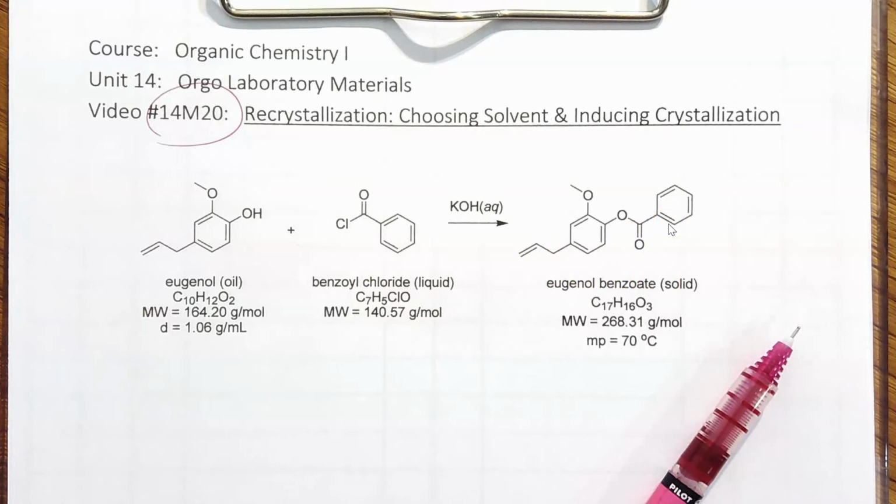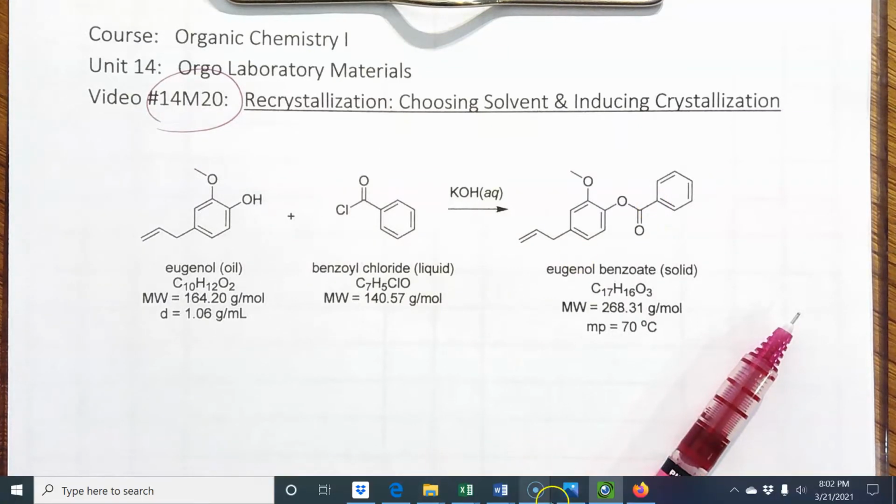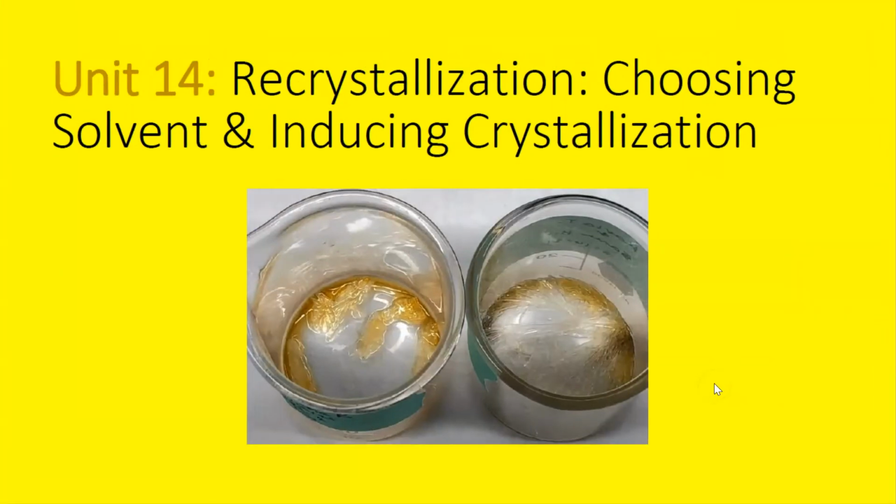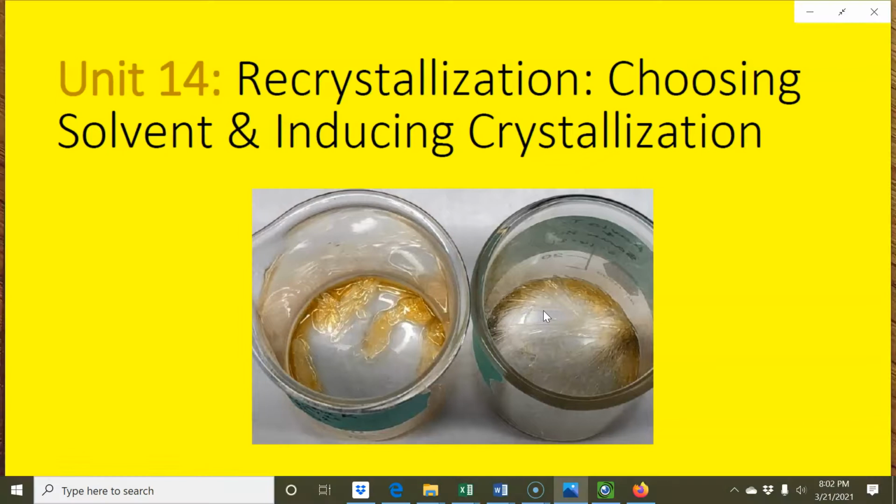But after a quick water wash and evaporation of the dichloromethane organic layer, the two students whose beakers I'm showing in the cover look like this. You see some crystals, but they are wet or coated with an oil, and I'm going to suggest doing a recrystallization. I'm not showing the final pure crystals because I want my students to discover that for themselves.